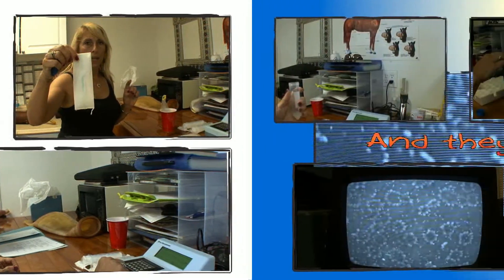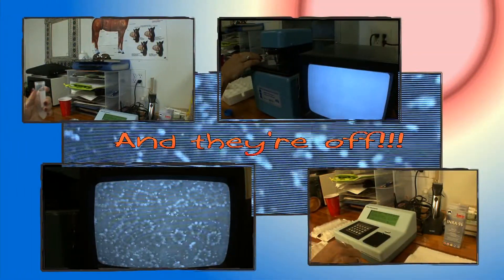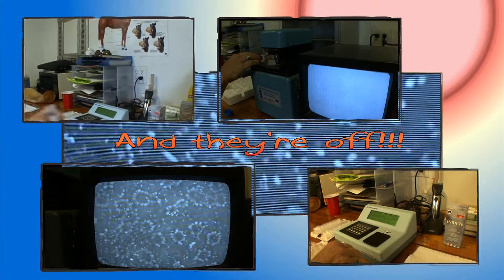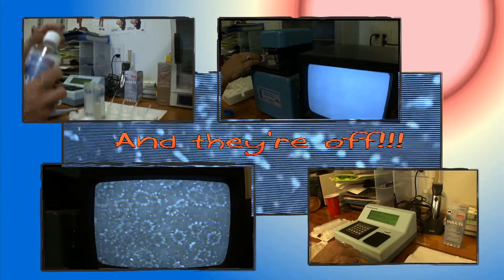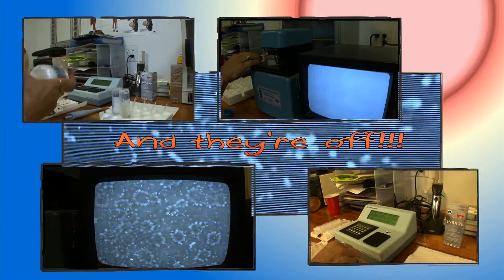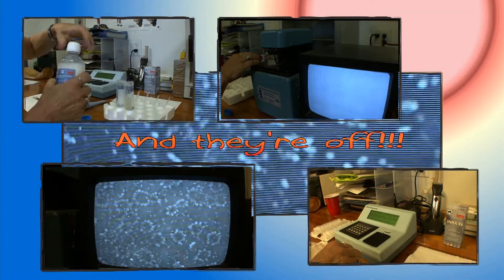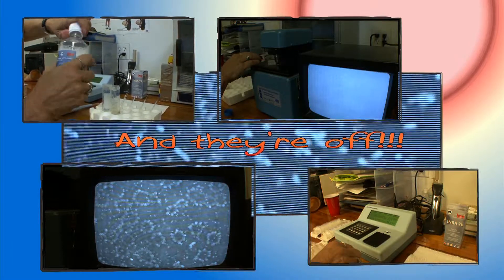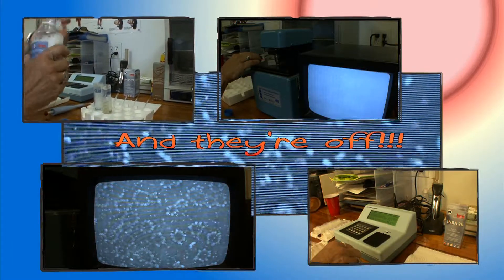And they're off! I'll get my extender. What we're using today is INRA, made by IMV. We've done testing with Amir and know that he holds best in this particular extender.